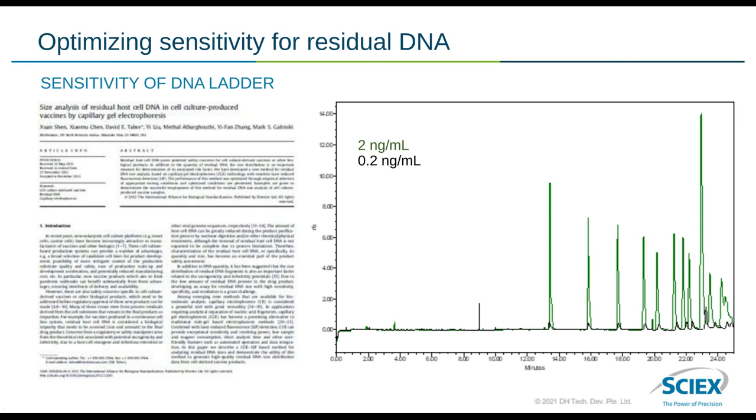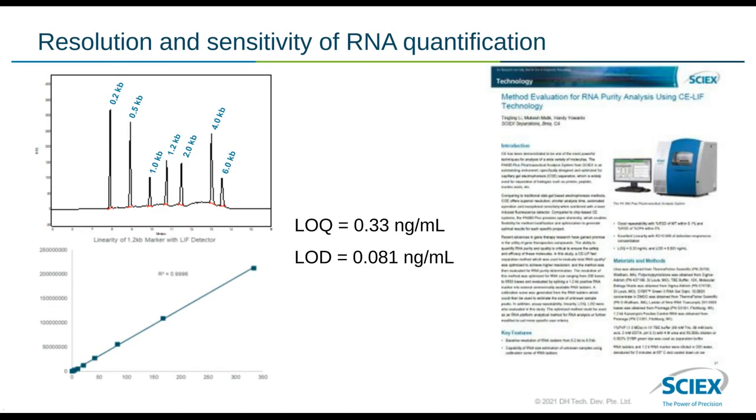And then when we're moving on to the RNA analysis, that's where we're switching to SYBR Green 2. So SYBR Green 2 is going to have a higher binding efficiency to RNA or single-stranded DNA. But both of those do have a much higher quantum yield than the enhanced LIF dye. So that's why we do that, to push even farther the limits of what we can do.